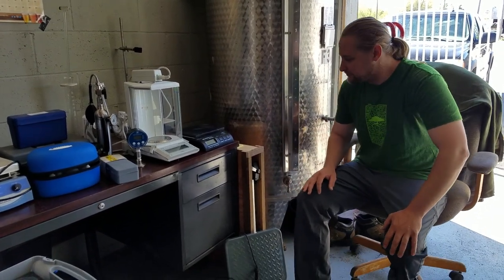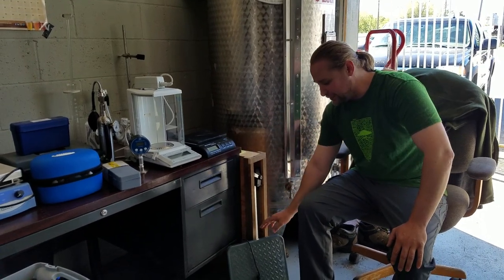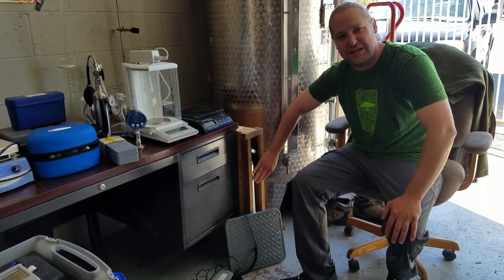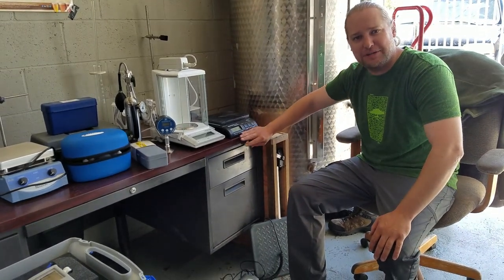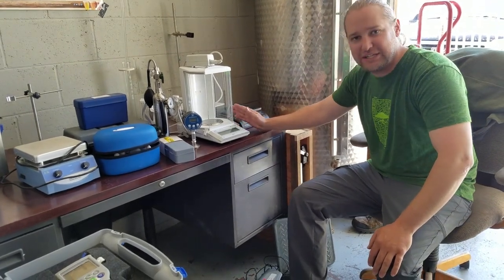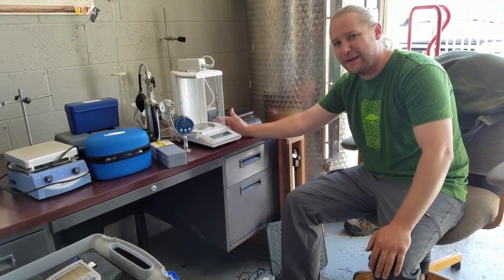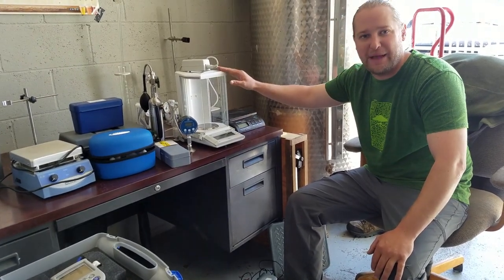A few bigger things in the lab: we have four different scales — a little one for grain, a bigger one for the yeast brite tank, a smaller one for hops and hop poundage, and our Mettler Toledo balance. This balance is accurate enough to do our yeast dilutions by weight rather than by volume.